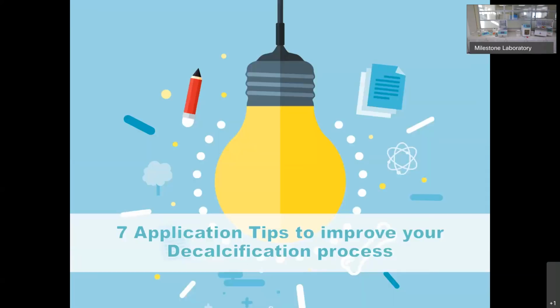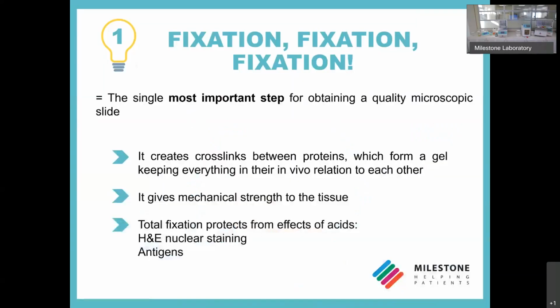Now, we finally move to the most interesting part of the presentation, where I will show you 7 application tips to improve your decalcification. The first application tip is fixation, fixation, and again, I repeat, fixation. Fixation is really a crucial step in the preparation of all histological specimens.